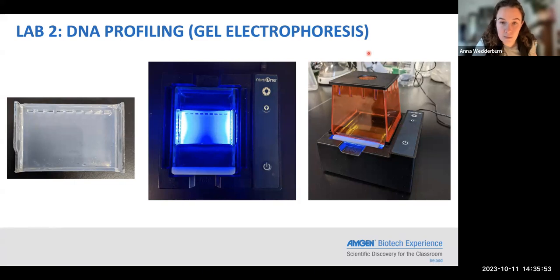The people who created these tanks have put in a little viewing thing at the top. So what you can do is put 2 pipette tip boxes beside it, balance the phone in it, and do a time lapse if you want. These machines are totally safe. They are made specifically for secondary school students.